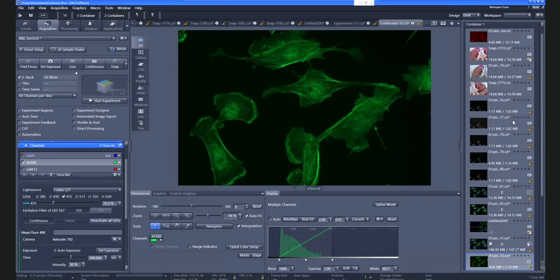So we have one question. Will the computer determine the distance to pixel ratio, or does it need to be done manually? If it has to be done manually, how do you do it? The pixel ratio. Do we talk about the display of our images? I don't know that, but maybe we will just leave it and follow up on this question personally if it needs a bit more explanation.